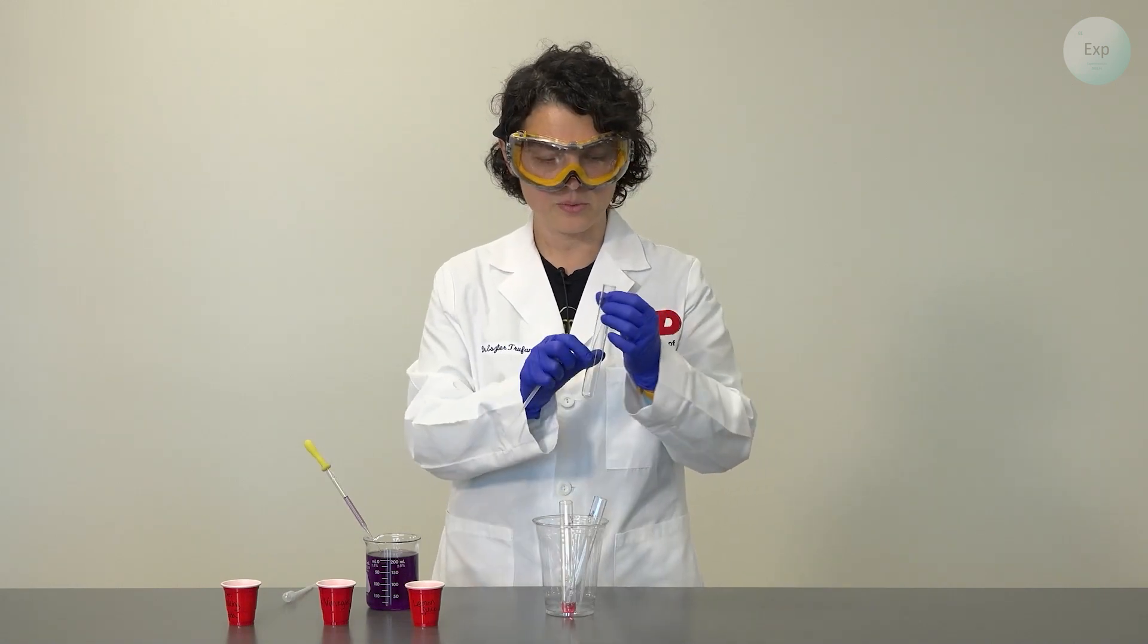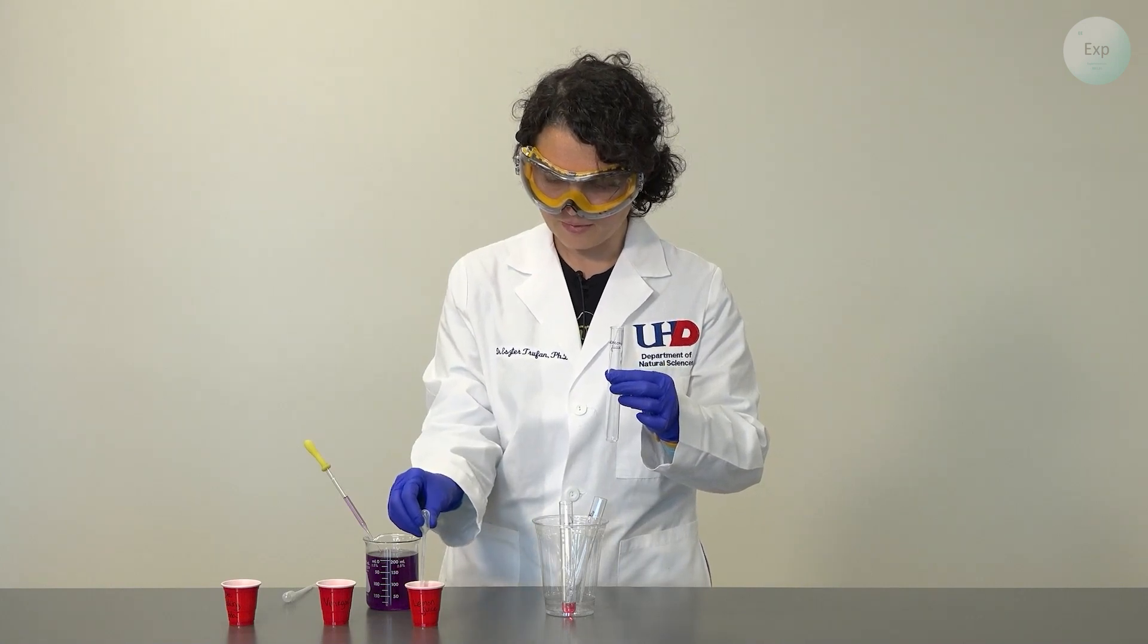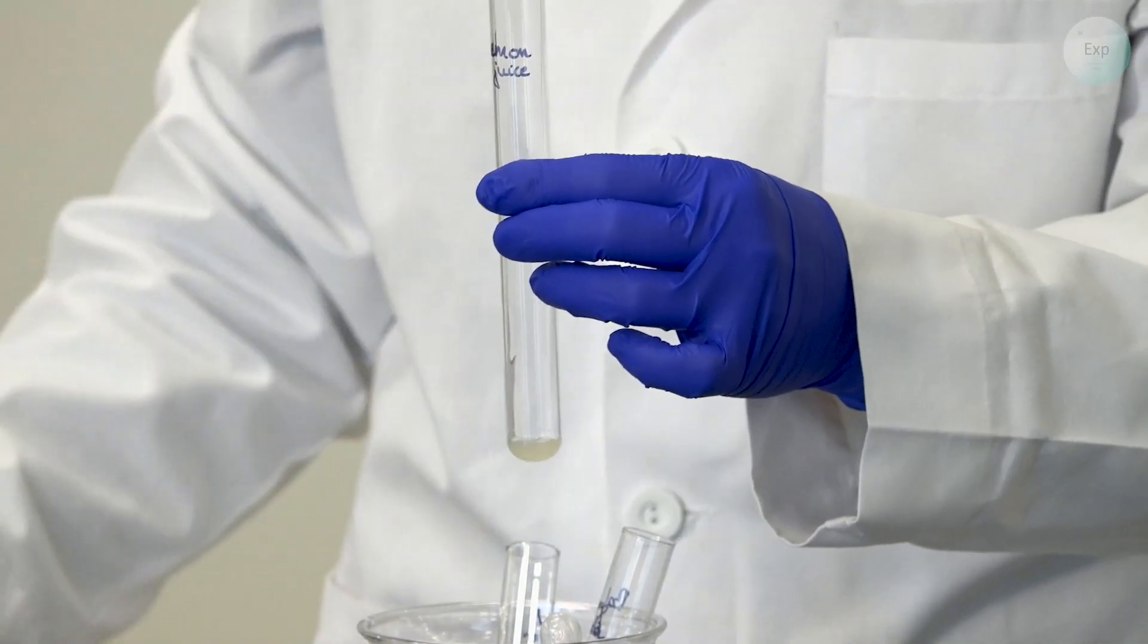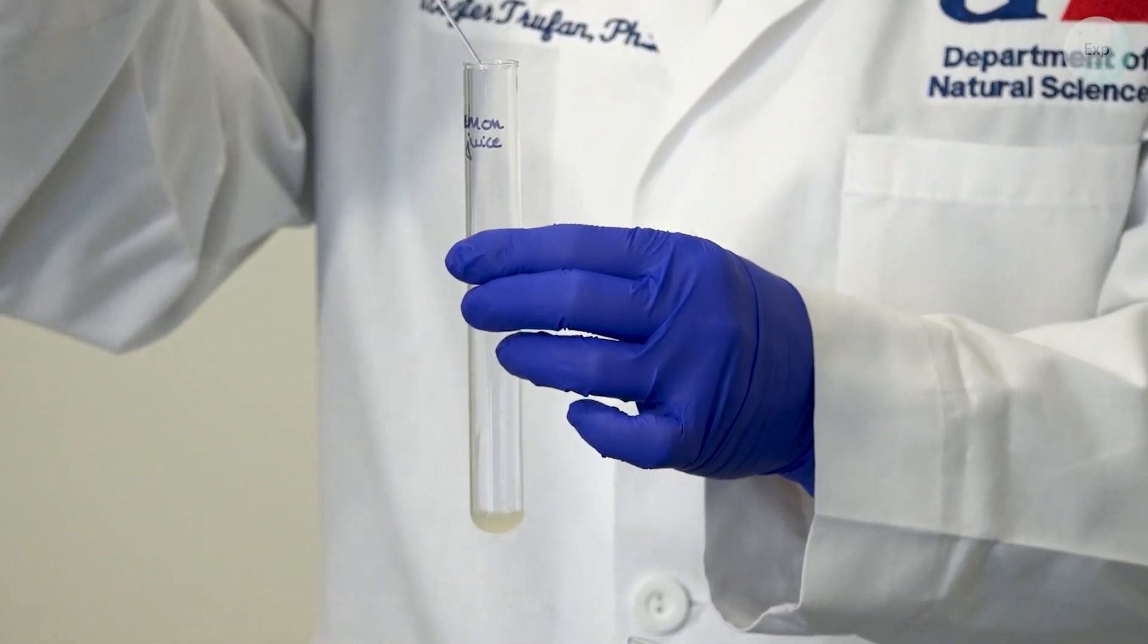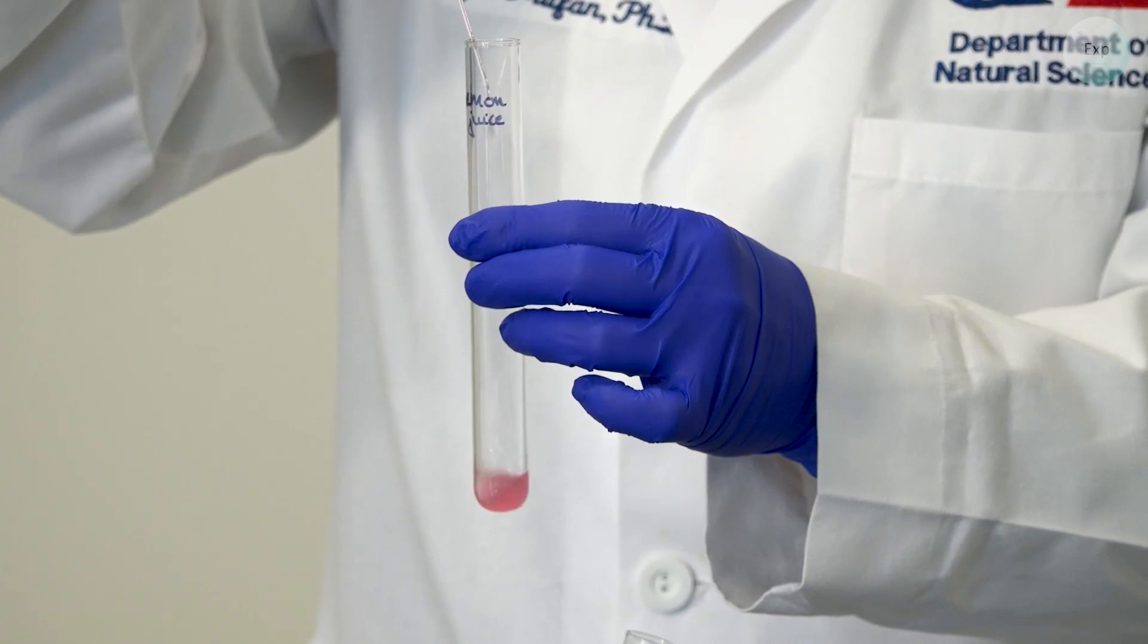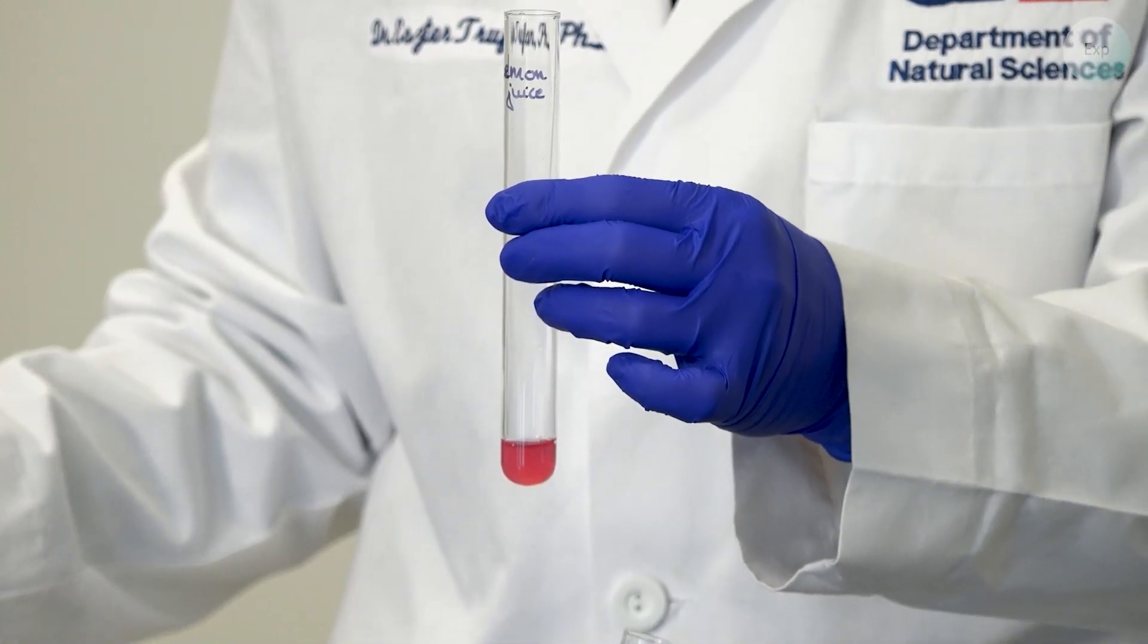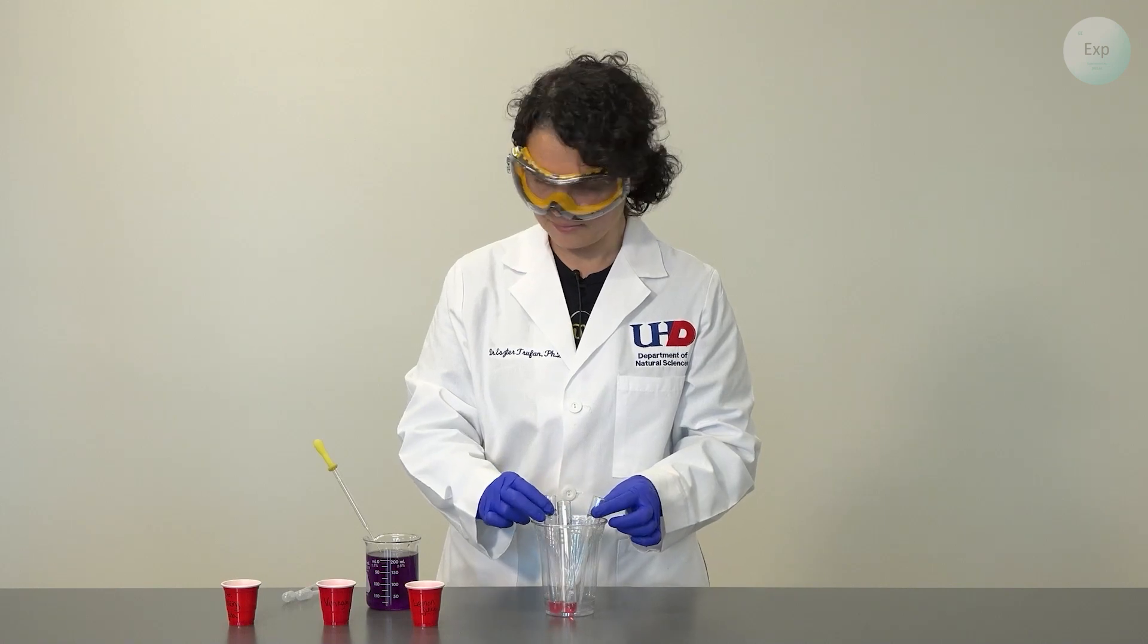Next I am going to look at my lemon juice. I will take a clean pipette, draw up some lemon juice and transfer it into the test tube. And then transfer some of the indicator solution in there. And I can see that there has been a color change again and this time it went towards a pink color.